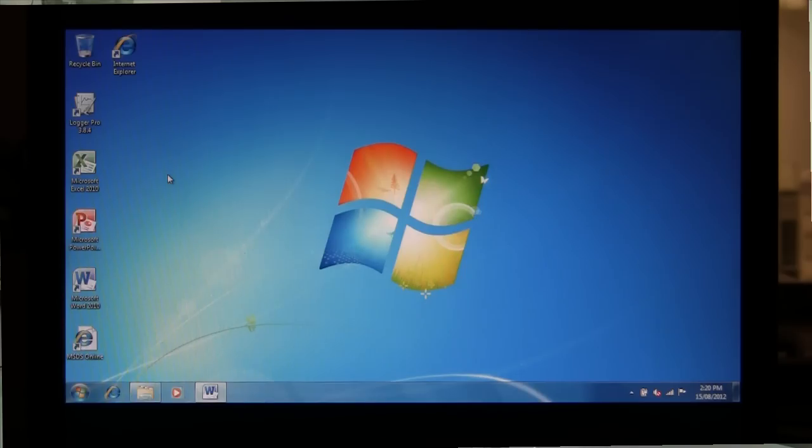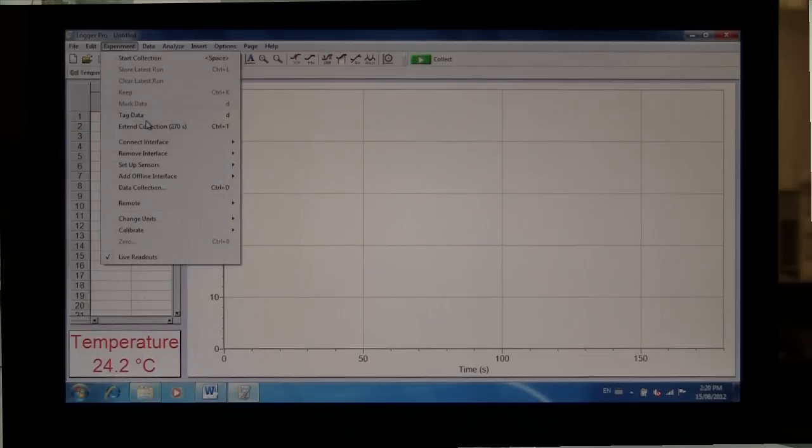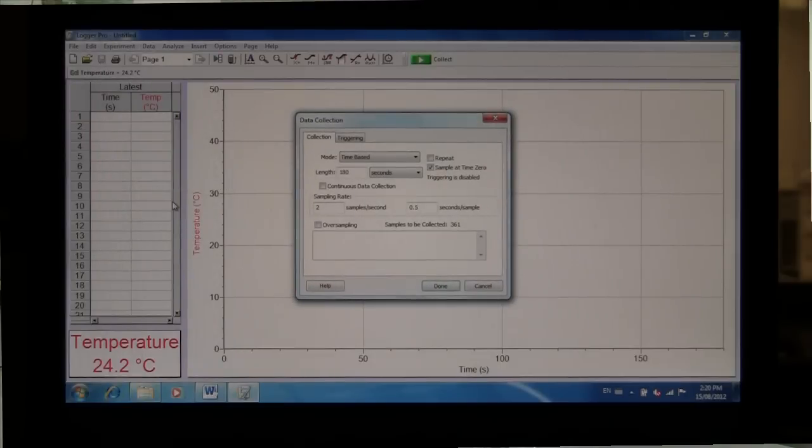So we're first going to load up the Logger Pro software on the laptop and we're going to set up the collection method. We're going to go into experiment and then select data collection and a window like this will pop up. You're going to change the length to 300 seconds and the sampling rate to one sample per second. And also check to make sure that continuous data collection is checked and select done.